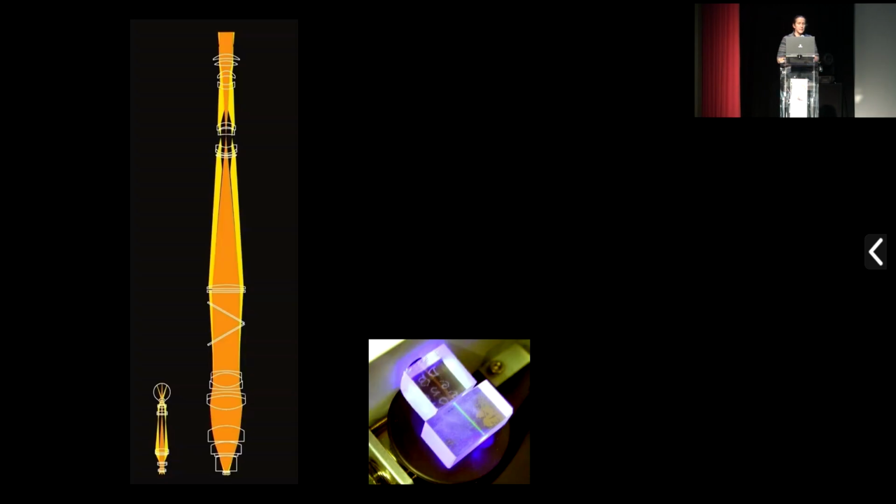So here we have 2 pieces of supposedly BK7, and we've put a UV laser pointer through them. What you'll see is that they're both wildly fluorescent. This one in the orange, this one in the green. We can use neither of these in the Mesolens because that fluorescence would kill our image.